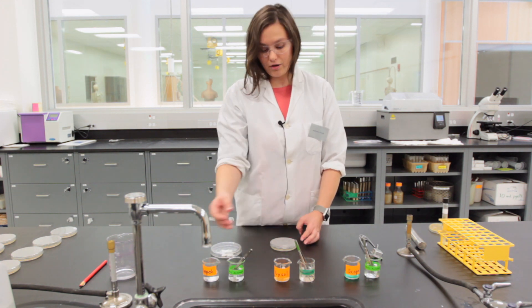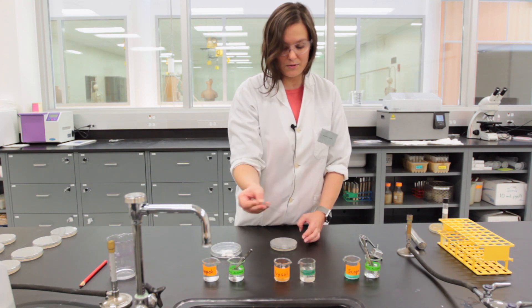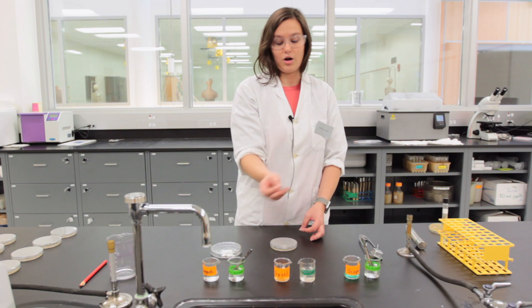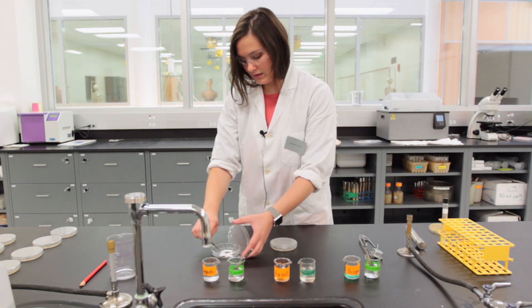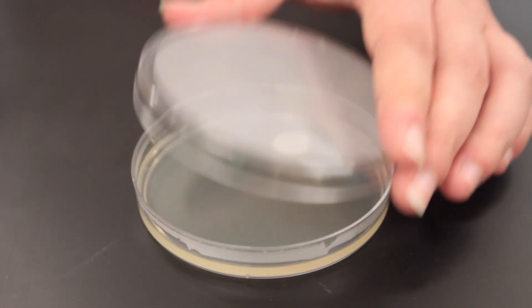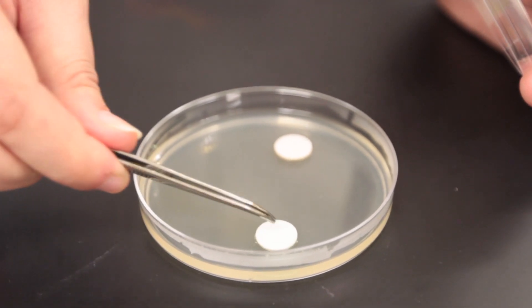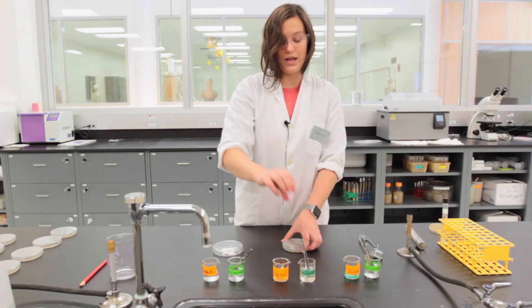Move to the other antimicrobial agents by grabbing the corresponding forceps for each antimicrobial agent so you're not cross-contaminating them. Again, grab one paper disc, dip it into the antimicrobial agent, and place it gently into the media, returning the forceps to the ethanol container.